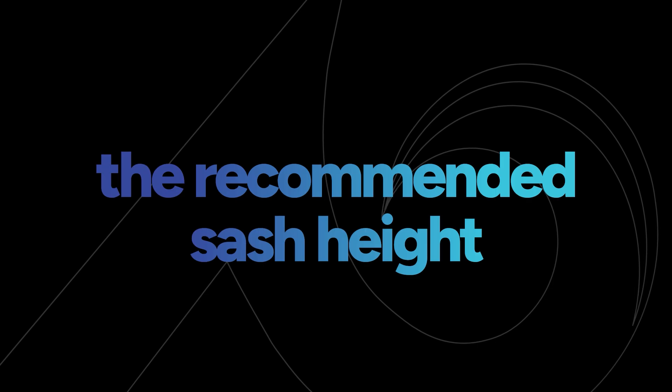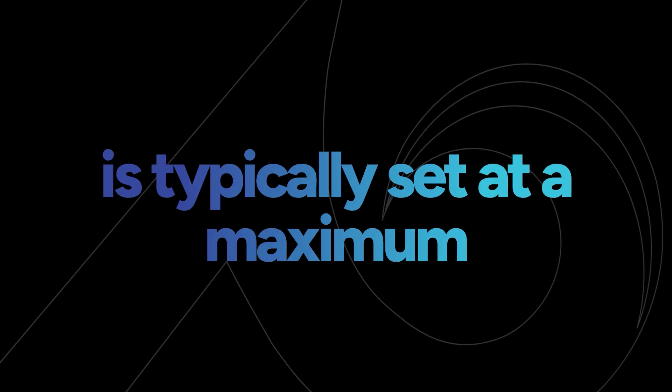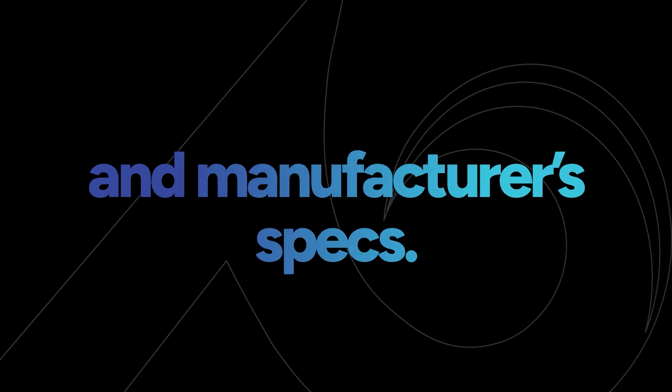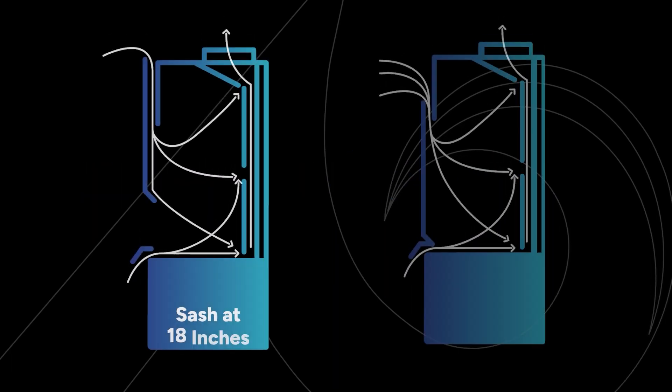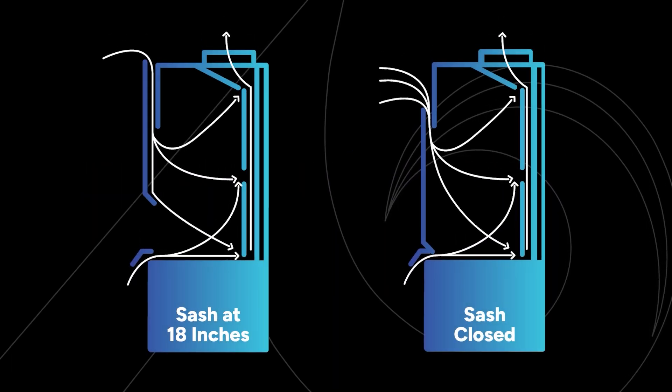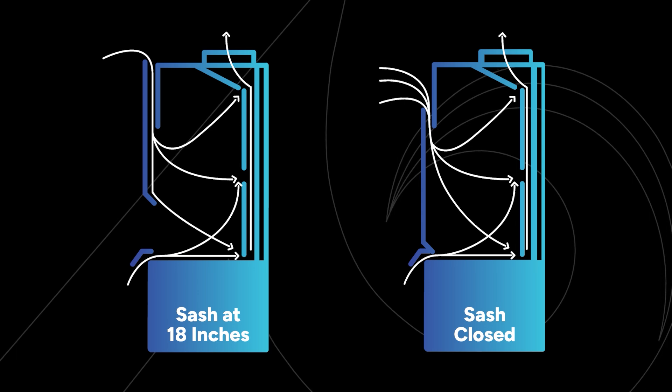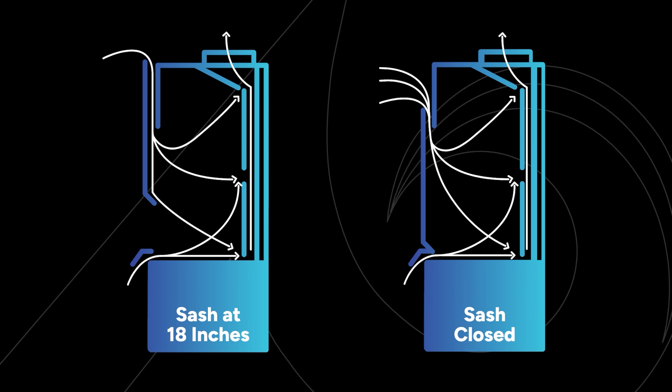The recommended sash height is typically set at a maximum opening of 18 inches, depending on the design and manufacturer specifications. This ensures that the fume hood's airflow patterns are effective in preventing contaminants from escaping into the lab environment. Depending on its design, the sash might move vertically, horizontally, or even in a combination of both.